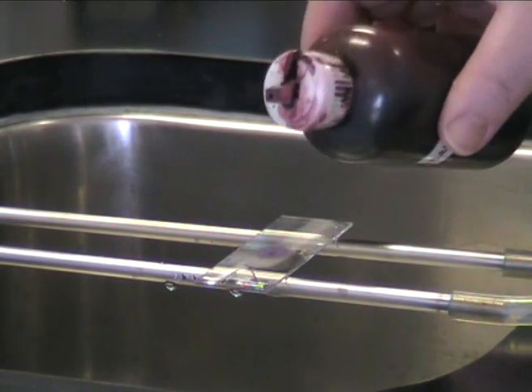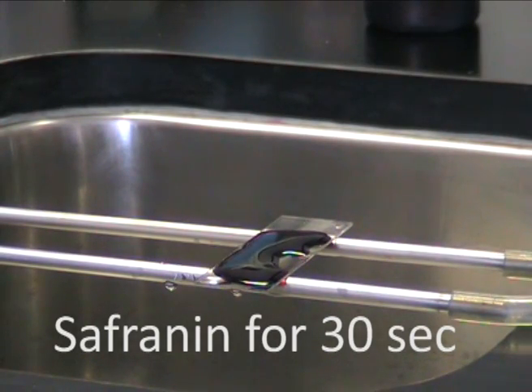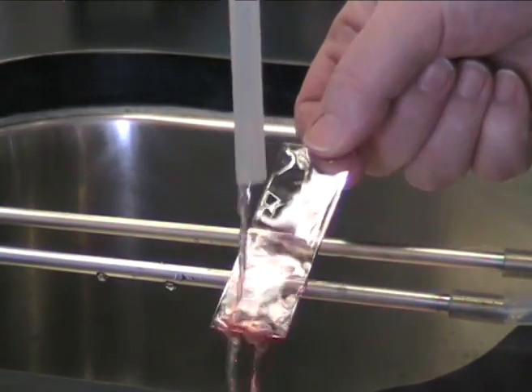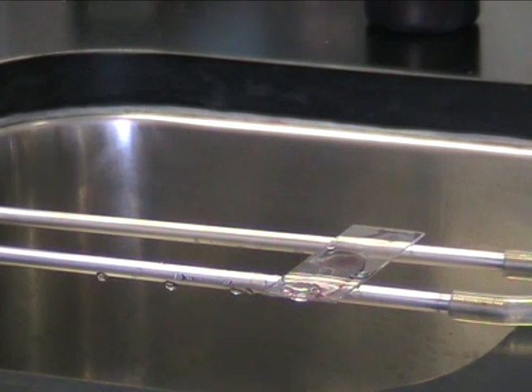Now counter-stain your smear with safranin and wait for 30 seconds. Rinse away the safranin with water, dry your slide, and it's ready to look at under the microscope.